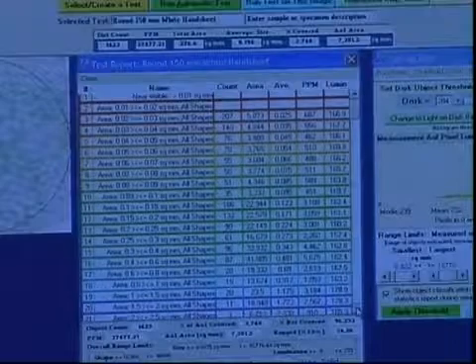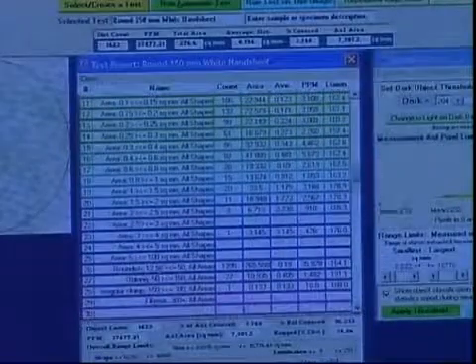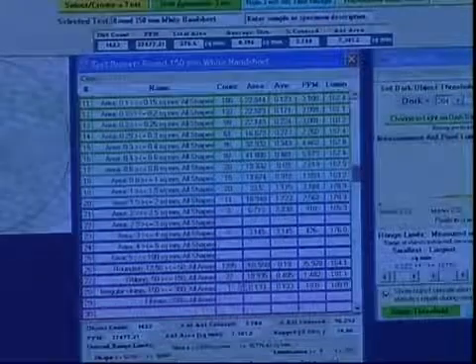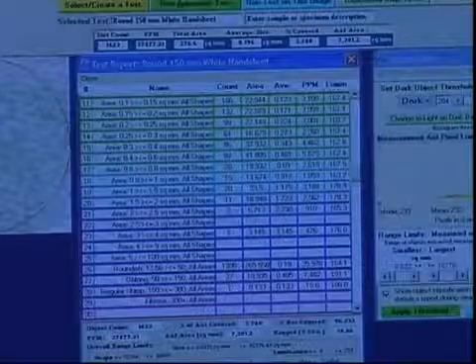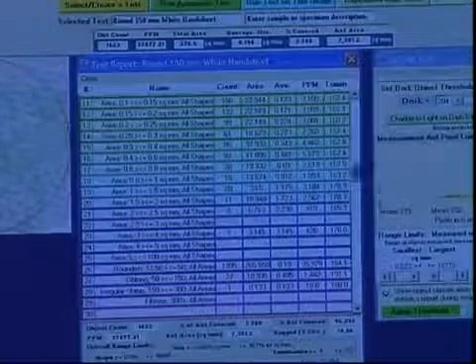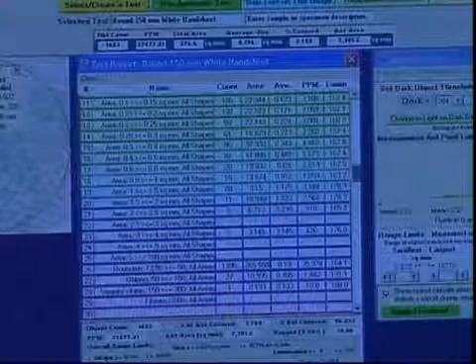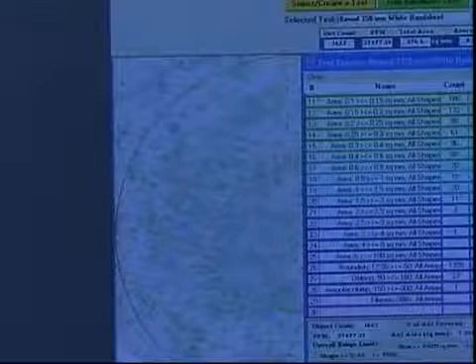At the bottom, you see that we have reclassified, and we have all the roundish specs, there are 1,300, and we have some long, oblong shapes at 27 and one of them. Down below, we have the statistics, and we can, in fact, find the smallest object by clicking on it, and it found it up there. I will magnify the image now just to show you what is going on.